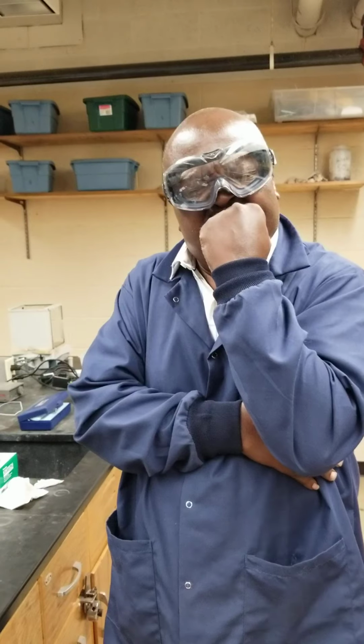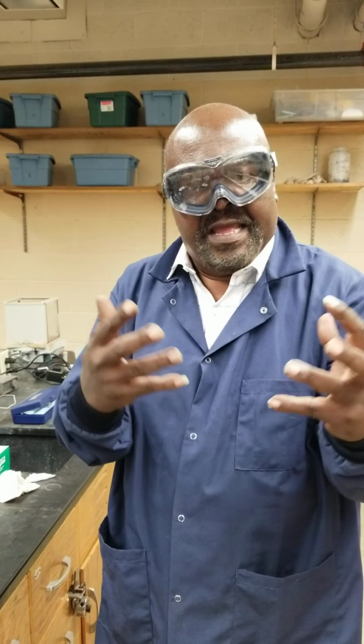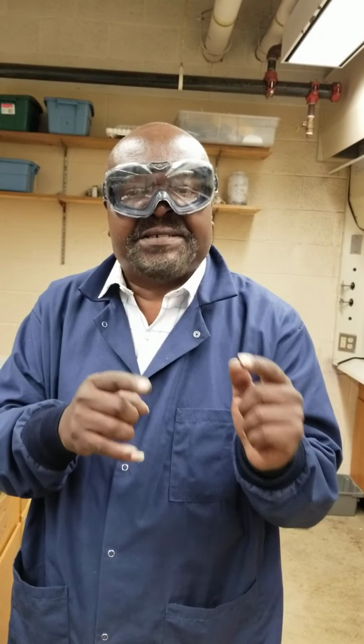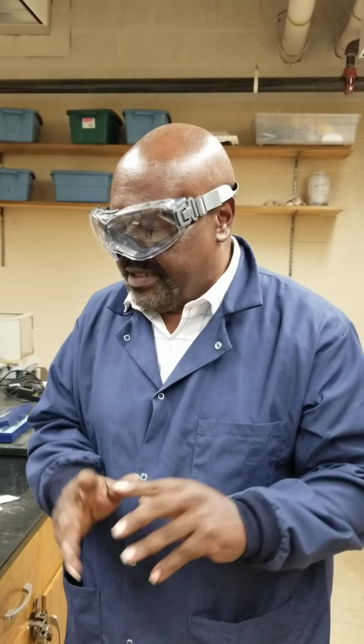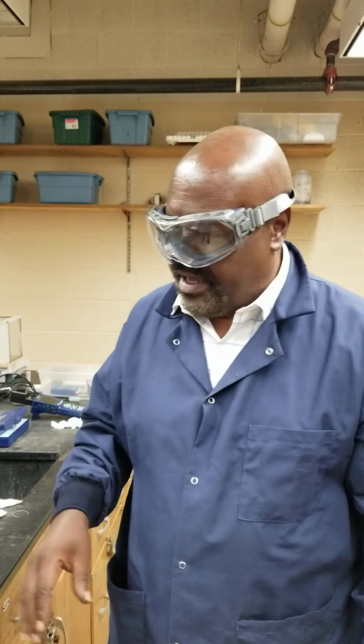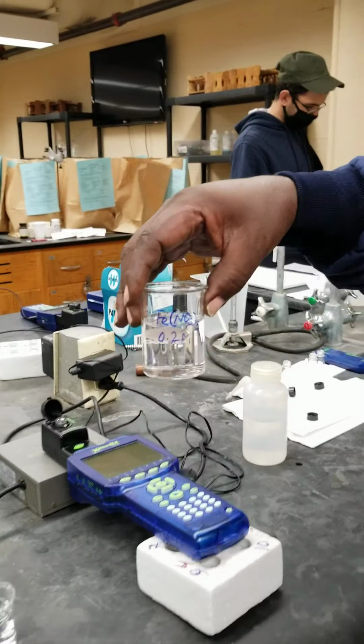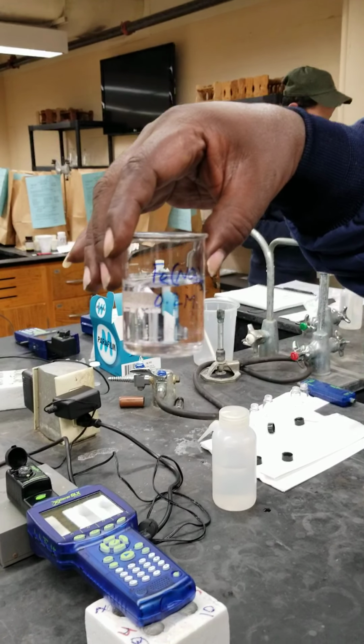Now, in this case, we want to do the calibration graph, absorbance versus concentration. The question is, we can't make known concentrations of the complex ion FeSCN 2+. It's just not possible to do so. So we'll do kind of a clever thing here. We'll react the two with one of them in very large excess.